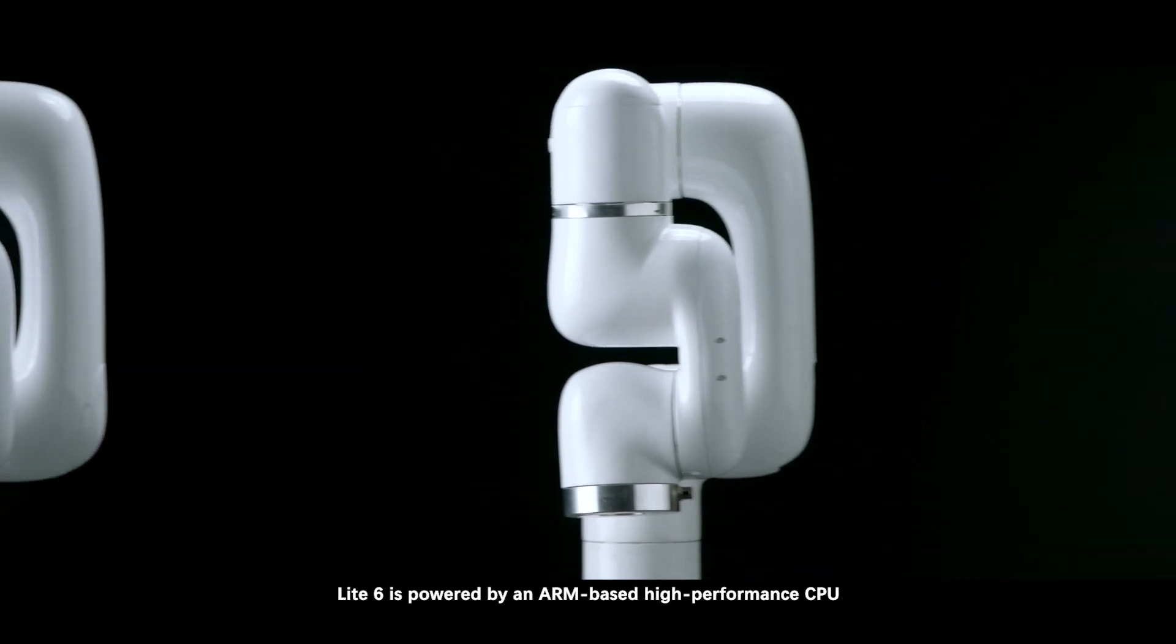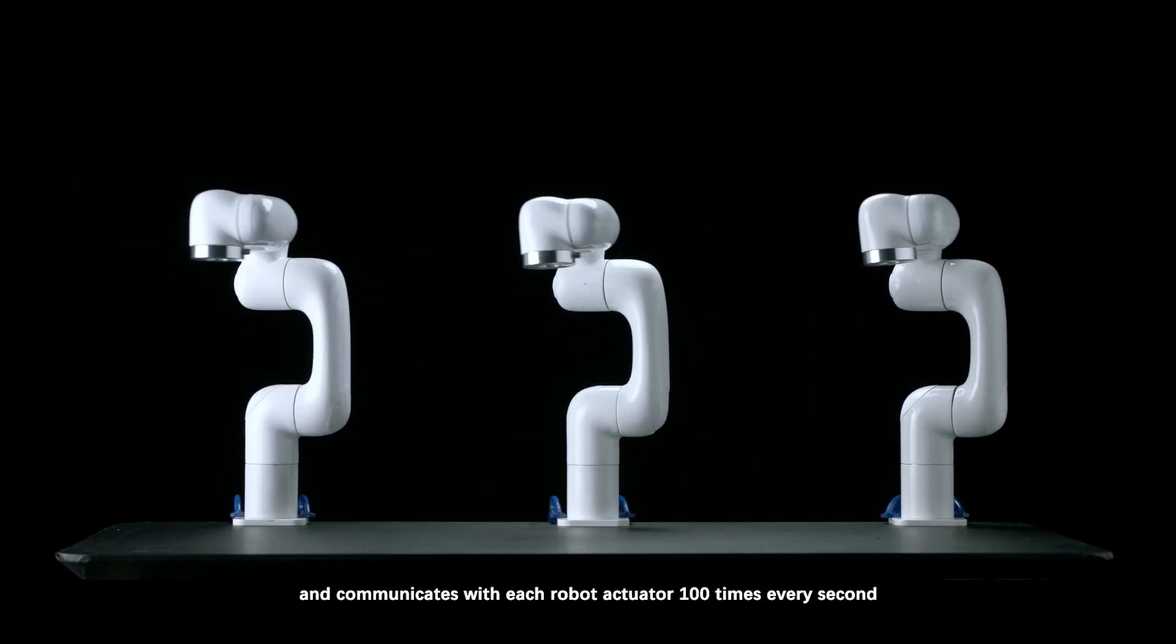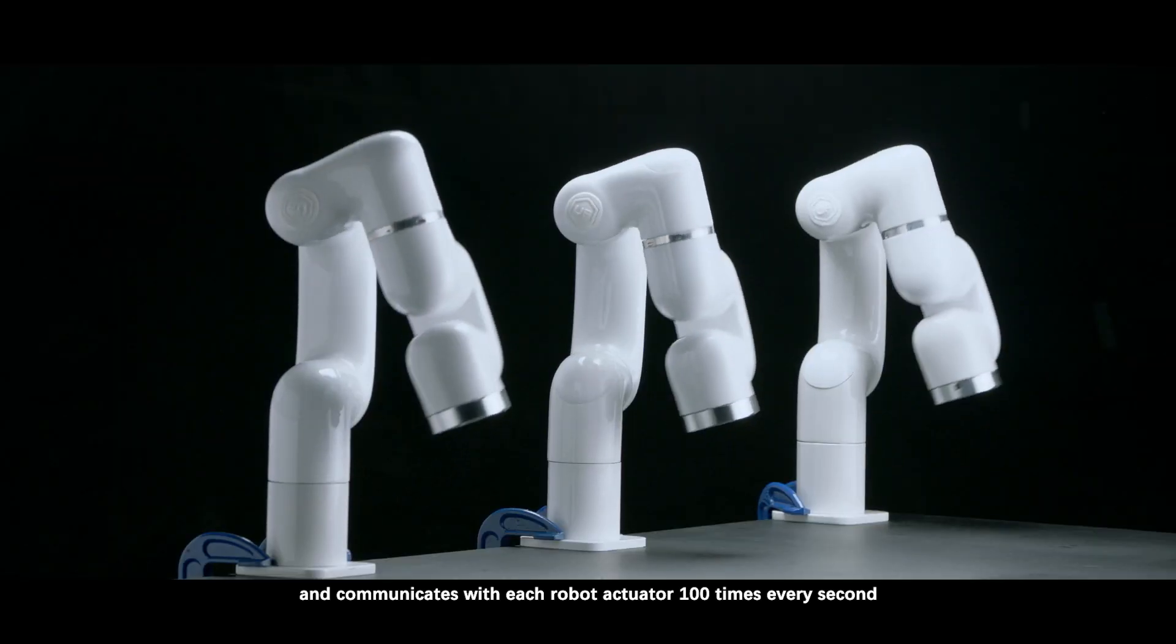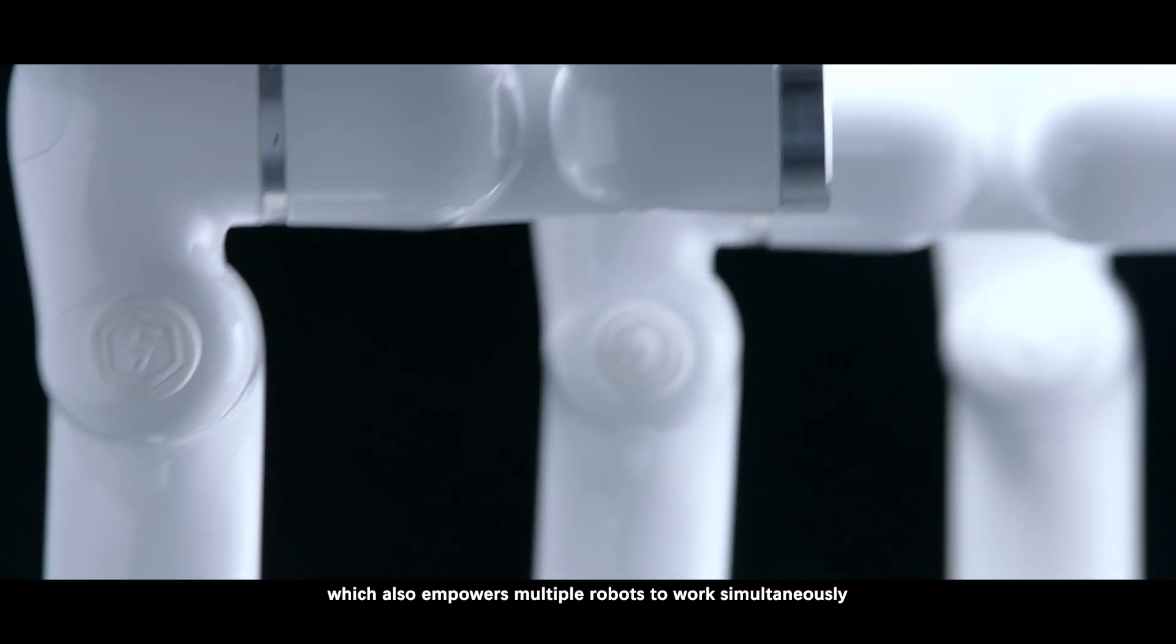Light6 is powered by an ARM-based high-performance CPU and communicates with each robot actuator 100 times every second, which also empowers multiple robots to work simultaneously.